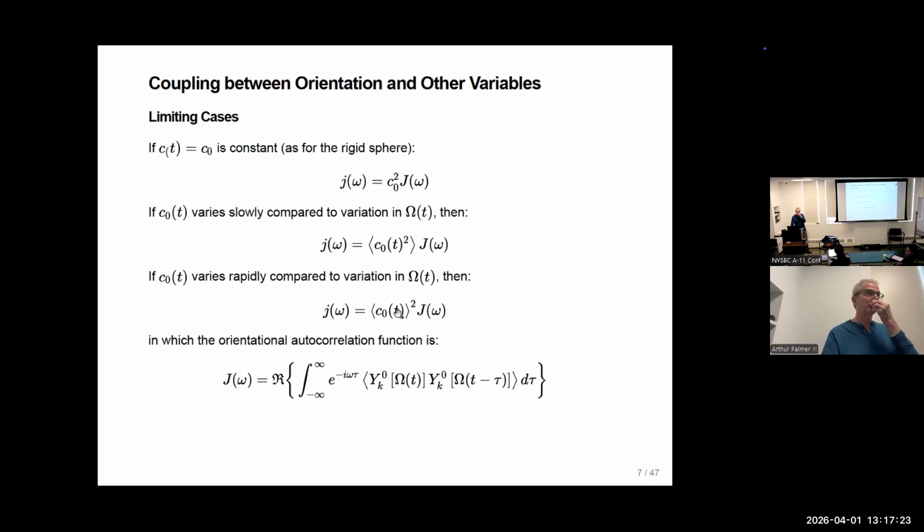For a while at least, the preferred value for NMR was actually a little longer than the best fit value from X-ray, not shorter. And if you were going to run the average of R cubed, you'd think you'd get a biased average that's shorter. So if you average in R cubed space and then you back out what that means R is, you bias short. And the argument was that that's because the angular fluctuations are more important than the distance fluctuations in that vibrational pre-averaging picture.